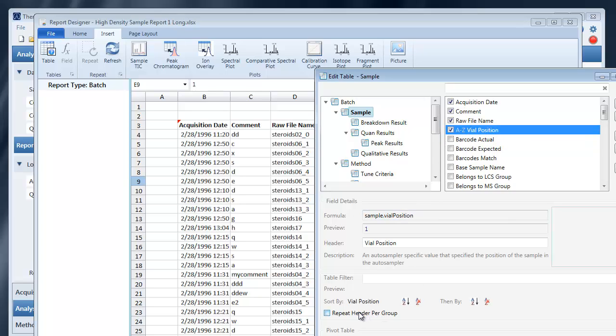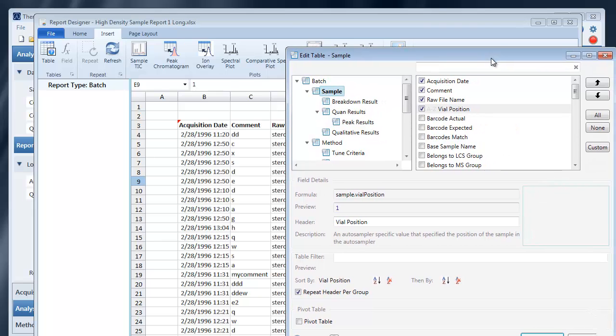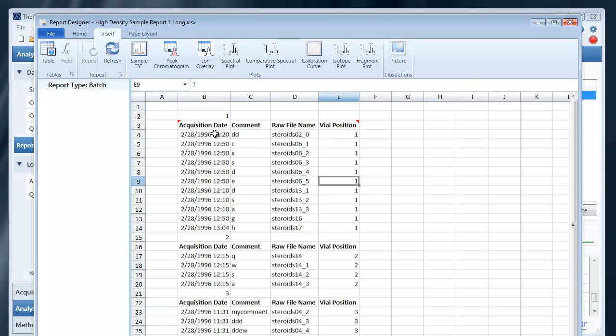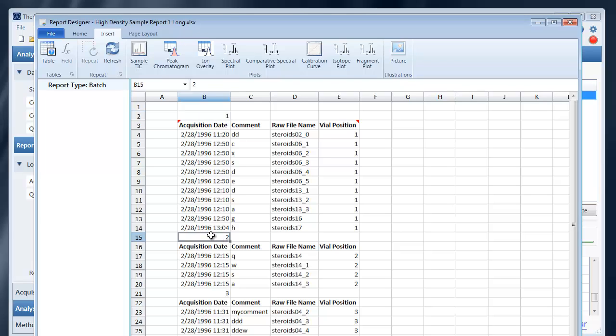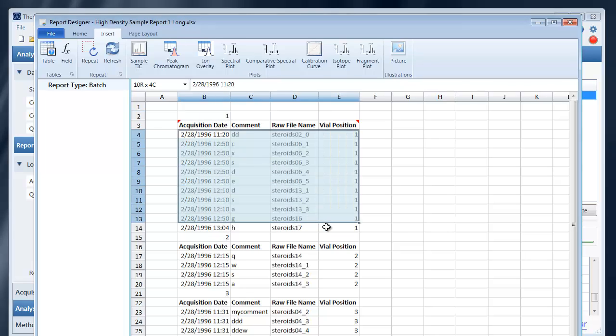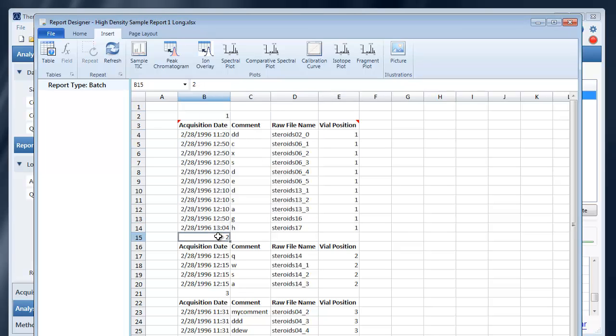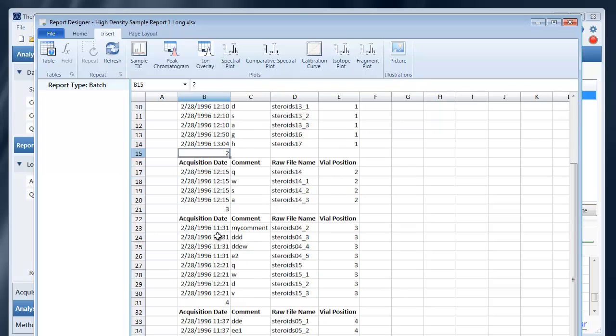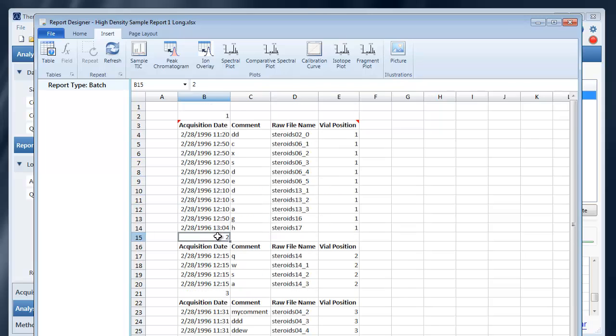And you'll get this A through Z text when you're sorting by that column. You can also choose to repeat the header per group. For example, we're grouping on the, we're sorting and grouping by the vial position, and so all the samples with vial position one are displayed here with the header for that group displayed above of each section.